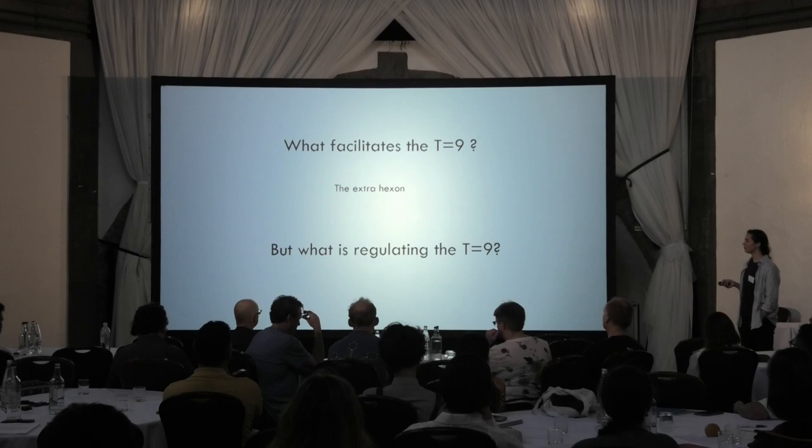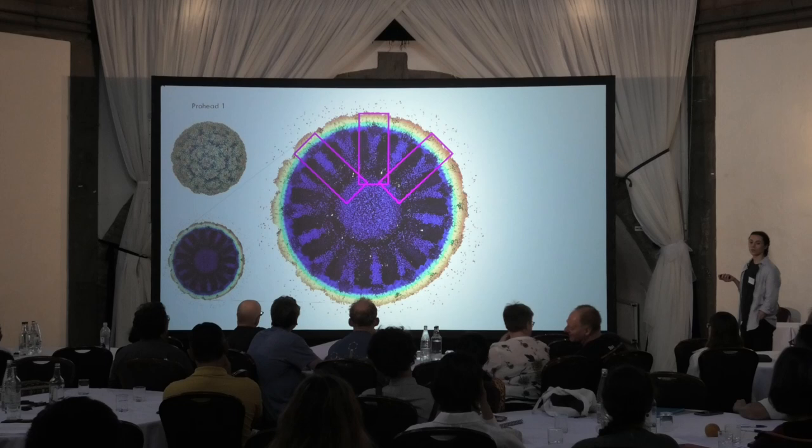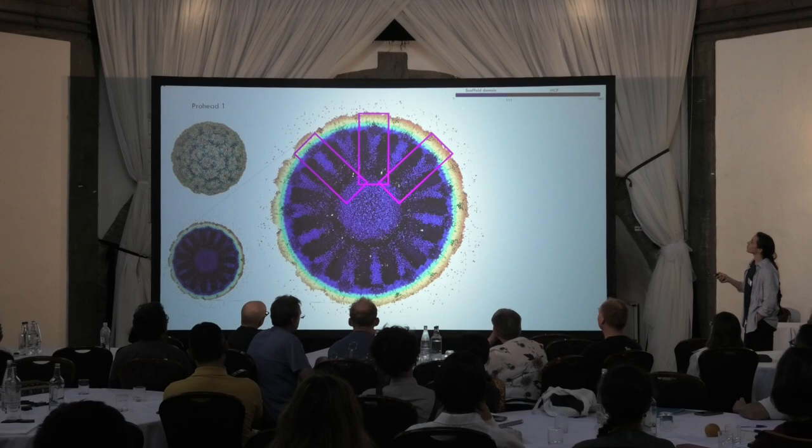And so to look at that, we're again at our prohead one, but now we've sliced it in half. So what you can see here are these interesting internal densities. And these are that scaffold domain that I talked about.